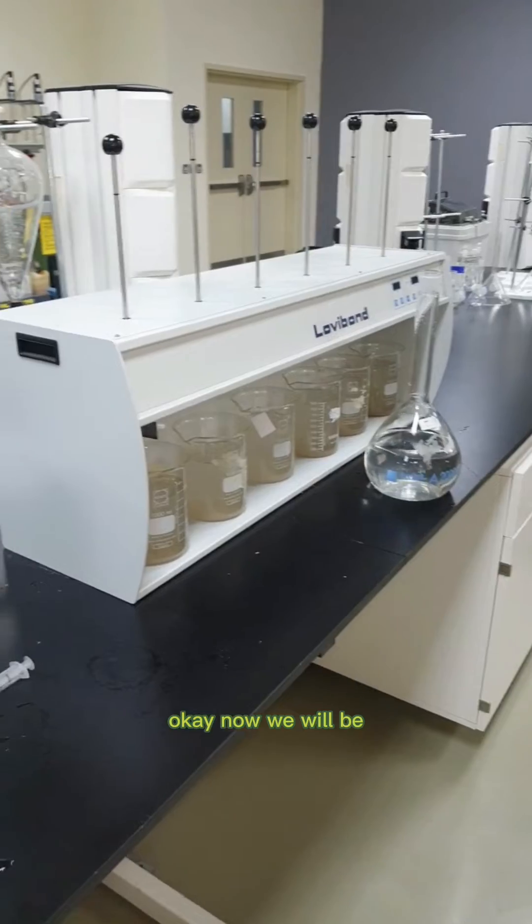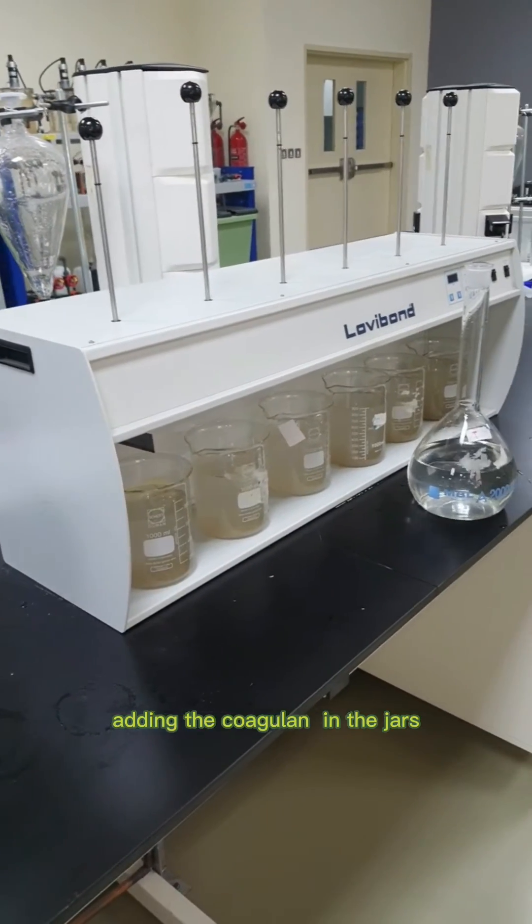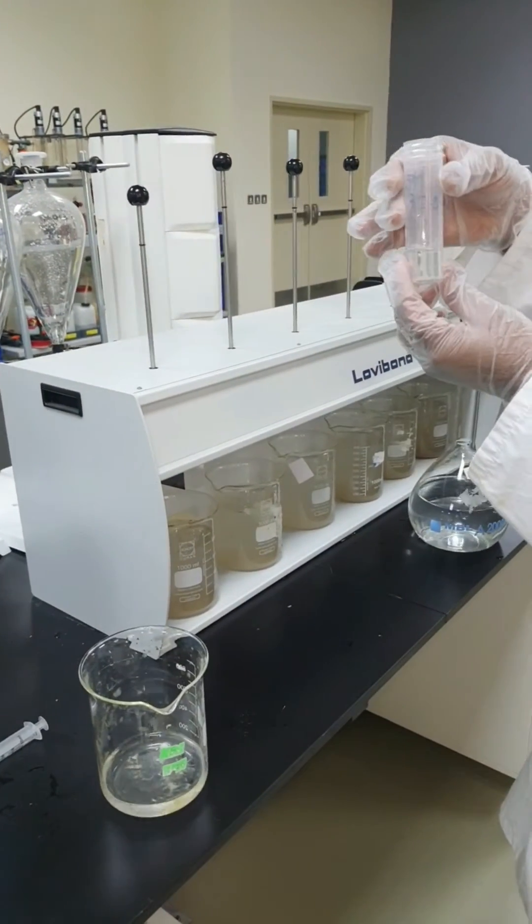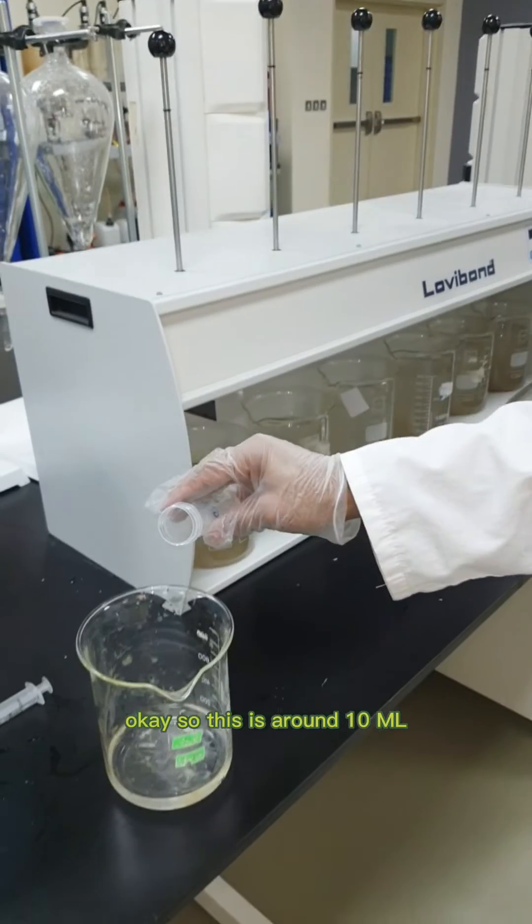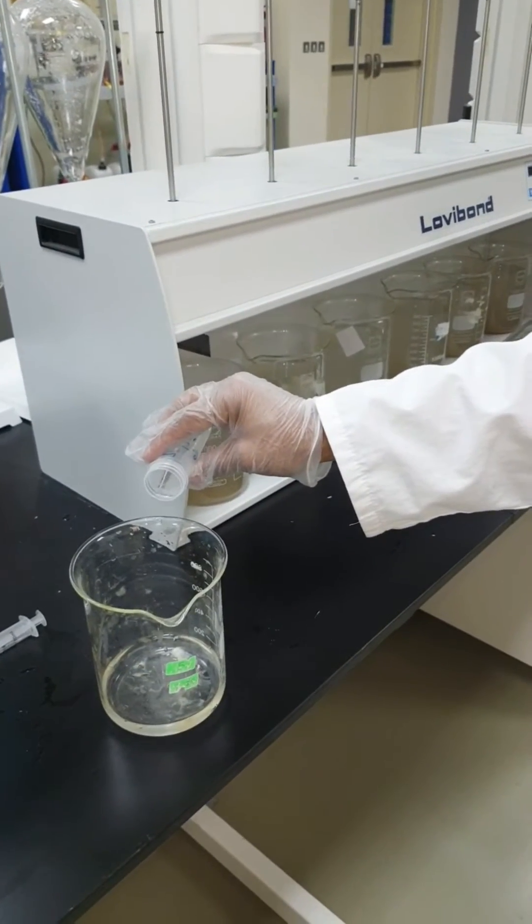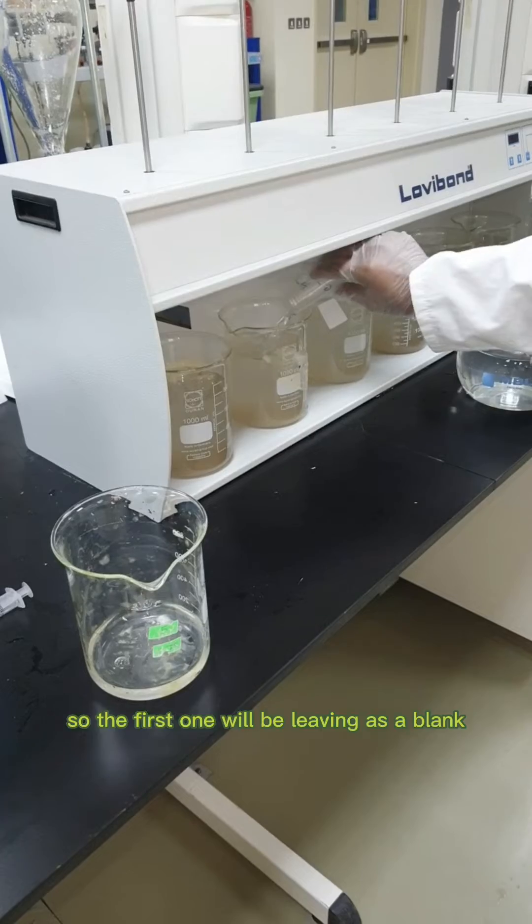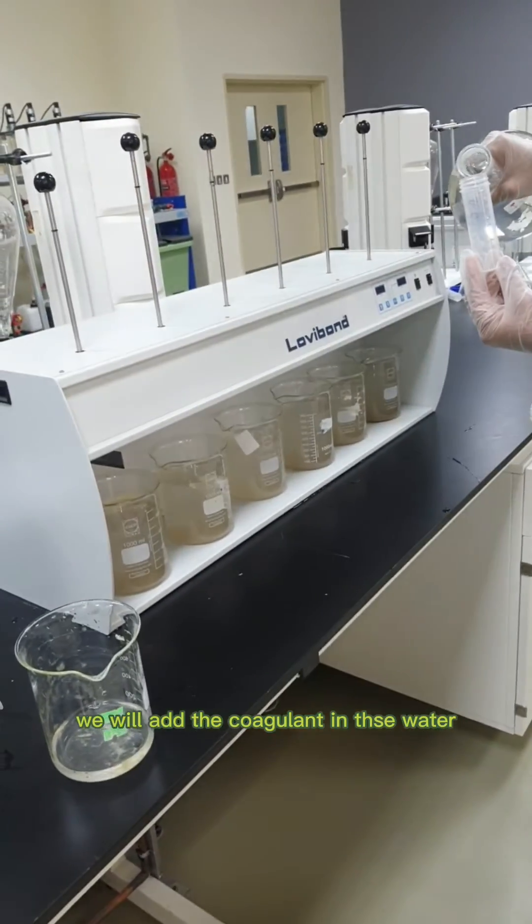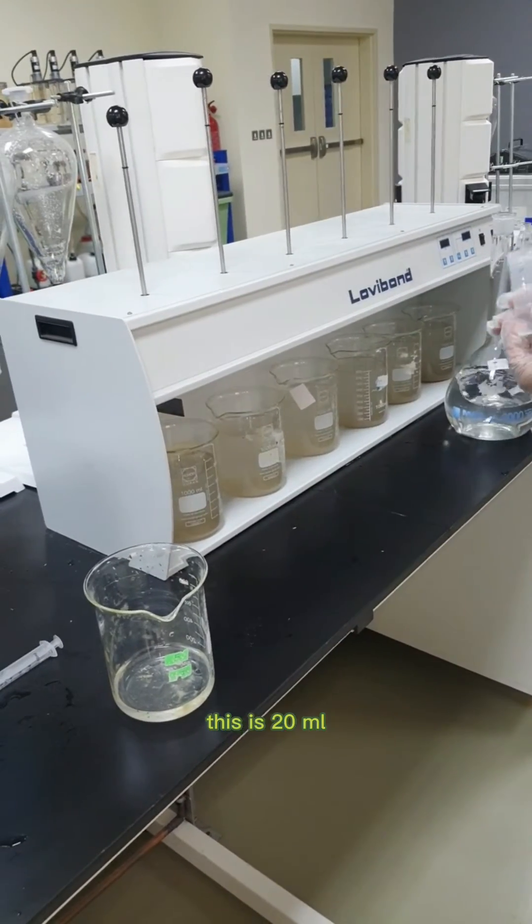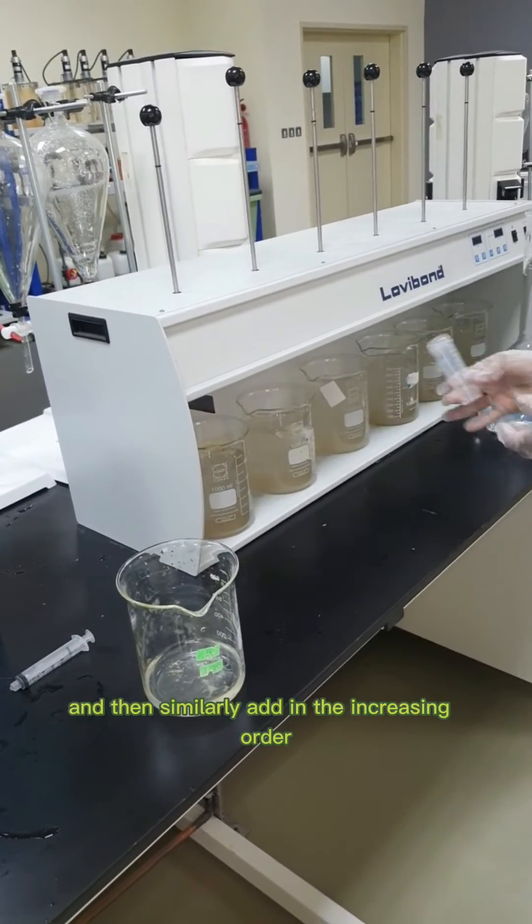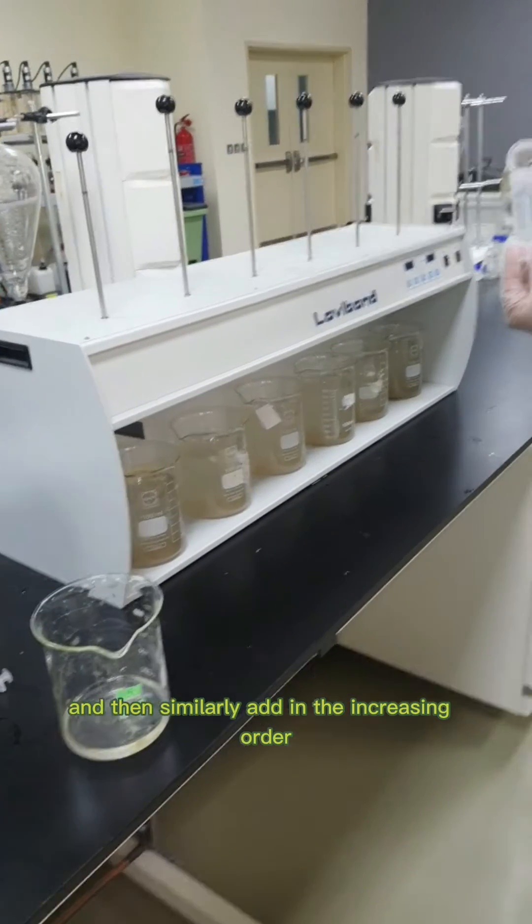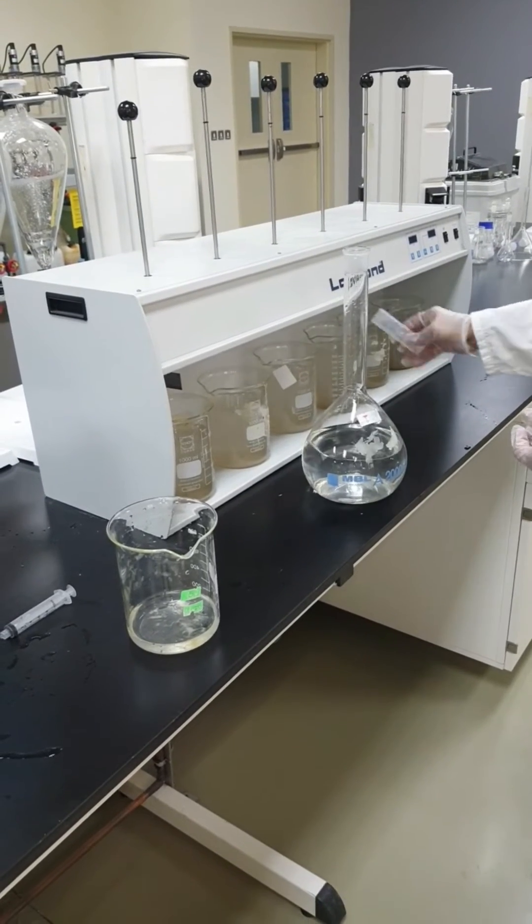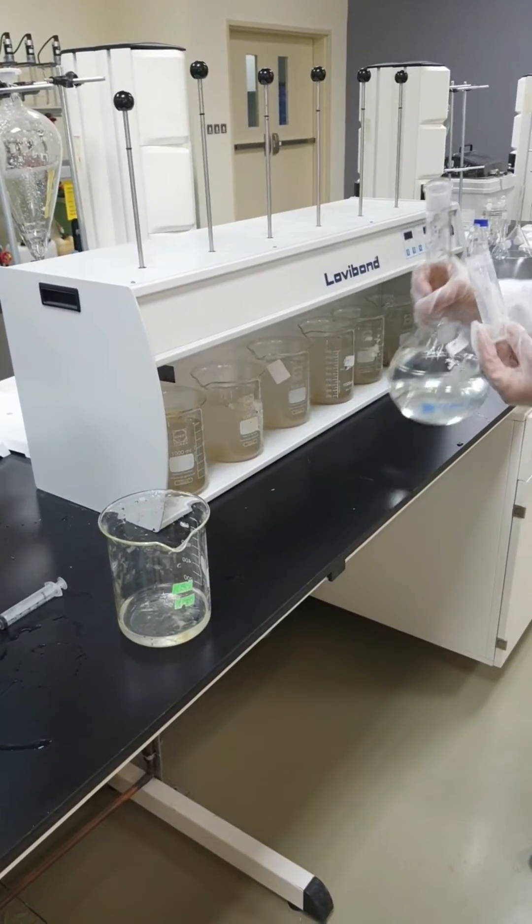Now we will add the coagulants to the jars in succession. This is around 10 ml. The first one we will leave as a blank, and then we add the coagulant to each: this is 20 ml, then 30 ml, and this is 40 ml.